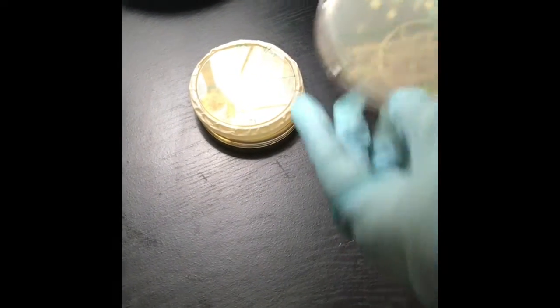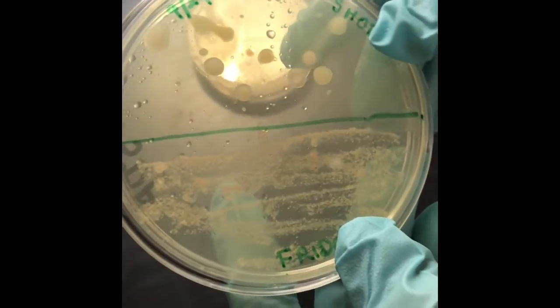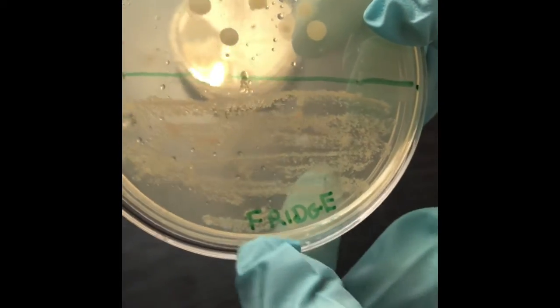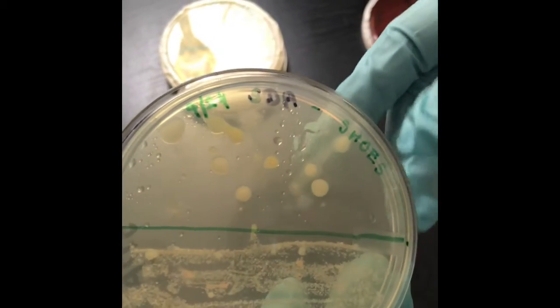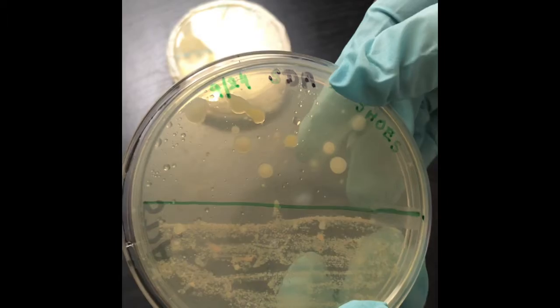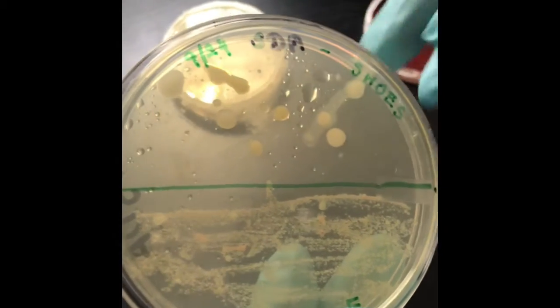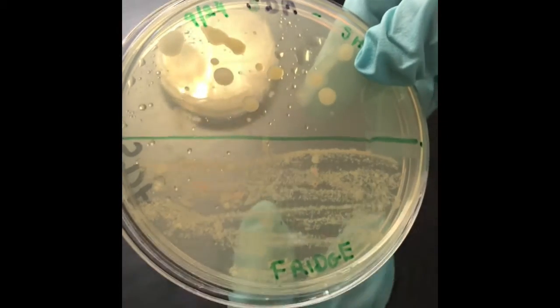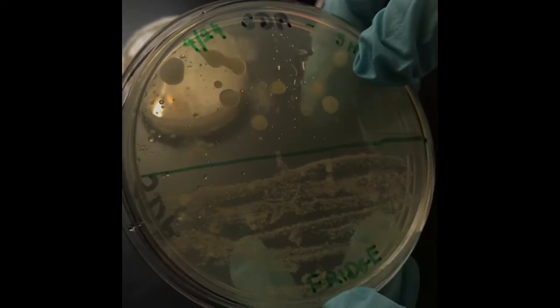Now this is the SDA plate. This one is also from shoes, and this part is from the fridge. But it seems my shoes are cleaner than the fridge. As you see, there are fewer colonies over here, and from the fridge a huge amount of microbes are growing.